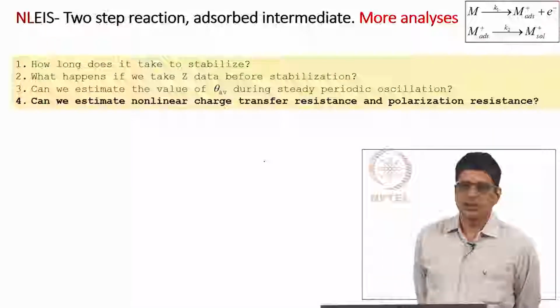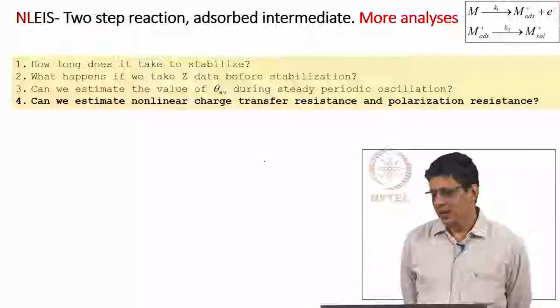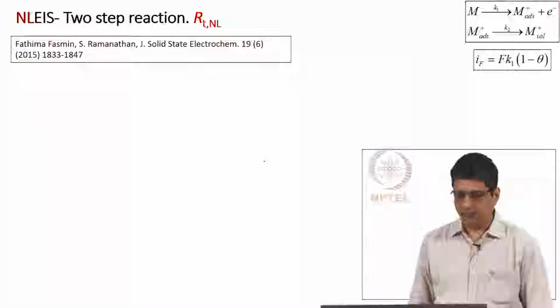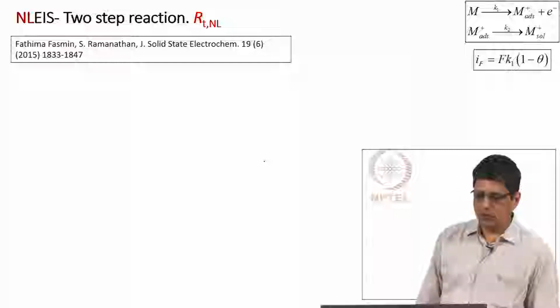Next, can we estimate the nonlinear charge transfer resistance or RTNL and the polarization resistance. So, this work was published by our group in 2015.